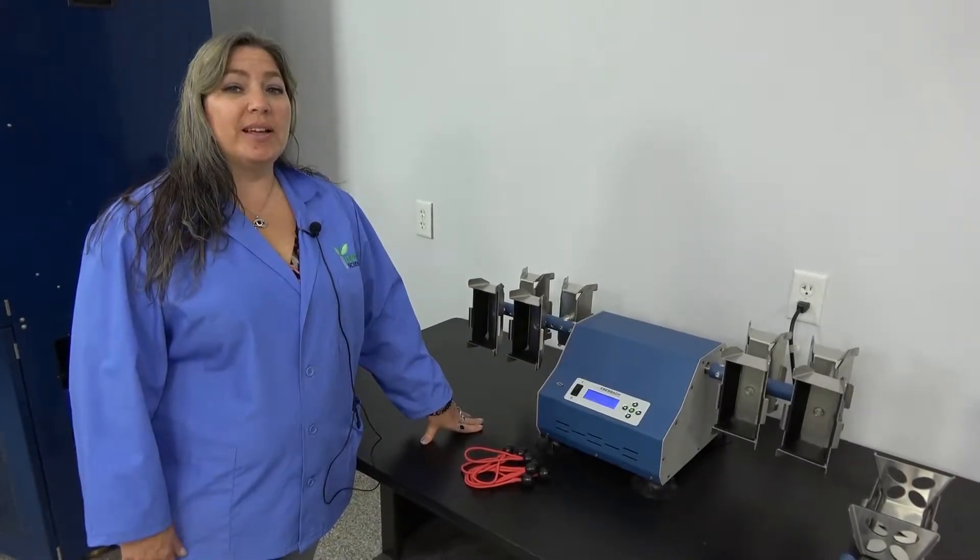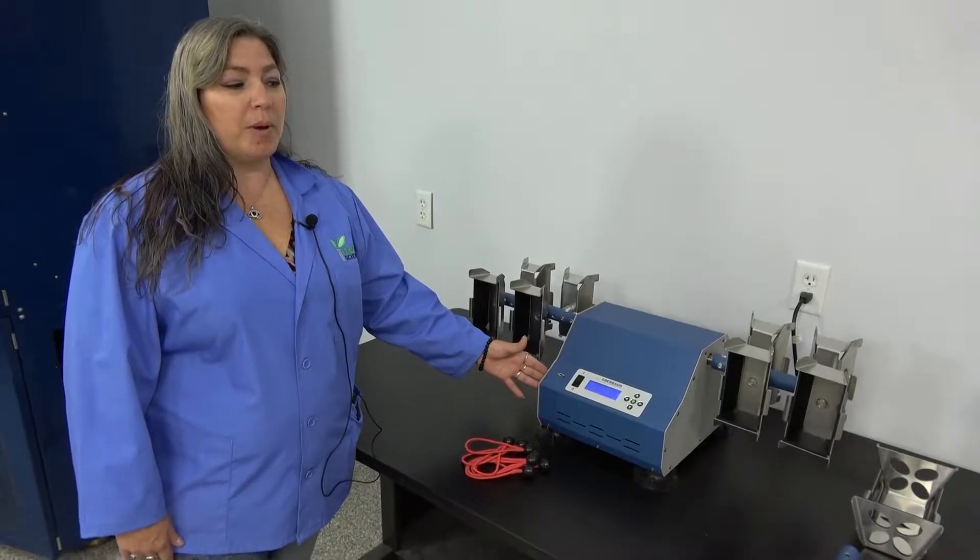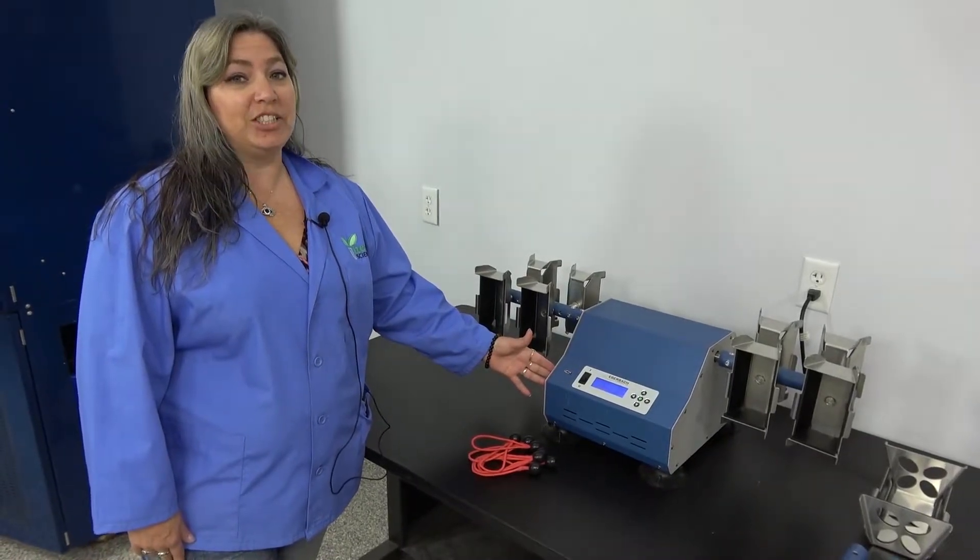Hi, I'm Lori, and we're at New Life Scientific. We're going to take a look at the Eberbach EL680 HD shaker.